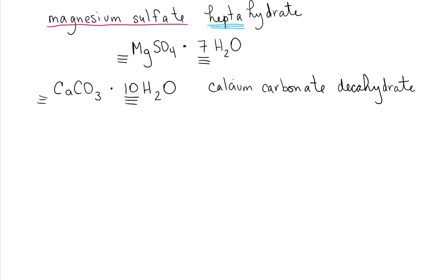You are going to take a copper 2 sulfate salt. Salt is just a generic word for an ionic compound, okay? So copper 2 sulfate is a salt. You are going to take its hydrated salt. You want to figure out how many waters there are associated with every 1 copper 2 sulfate. And in order to do that, you're going to take this salt. You don't know how many waters there are, and you are going to heat it.